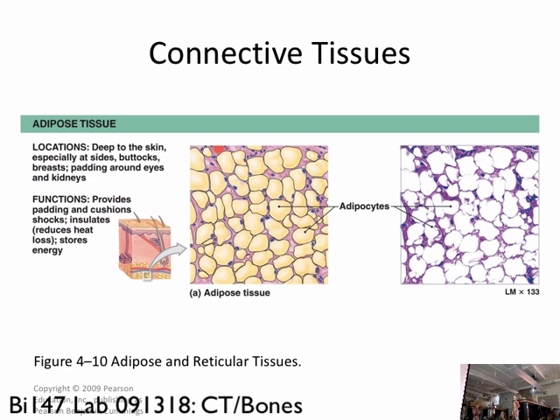These are phase contrast scopes. Right there. Dial you in. Okay, this looks pretty good. So take a look at that. You can see that's pretty zoomed out. And it's very faint. And then you're going to be able to zoom in a little closer. Follow the protocol like that. Yeah, you see that there? Okay. Anybody else having a hard time? Everybody good?